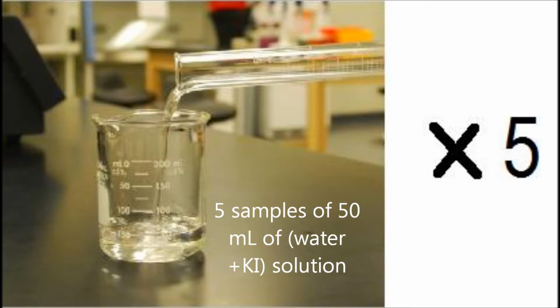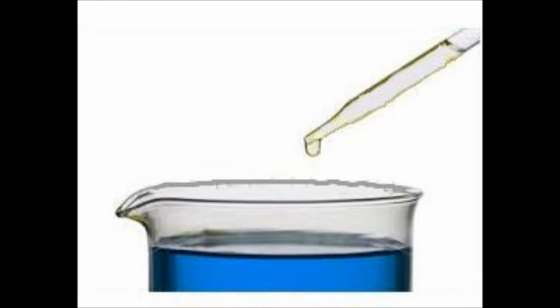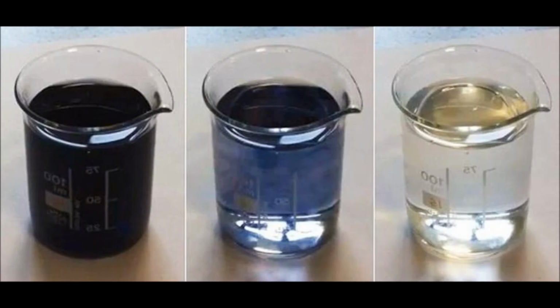Taking 50 milliliters from the large beaker with a graduated cylinder and pouring it into a smaller beaker, we slowly added drops of the sodium thiosulfate solution using a pipette until the color of the overall solution turned from dark blue to colorless. While one person was adding and counting the drops of sodium thiosulfate, another person made sure to keep swirling the water around. A white paper was placed under the small beaker with 50 ml of water solution so that the person adding the drops could see the change in color better.